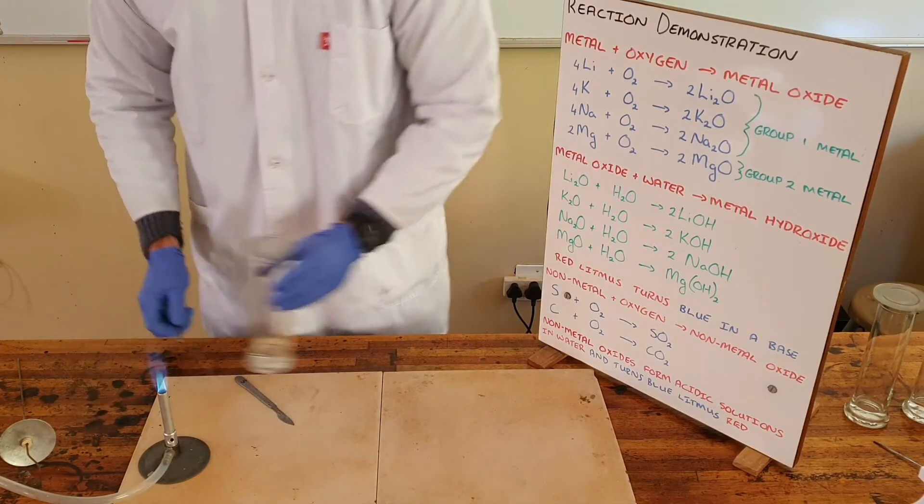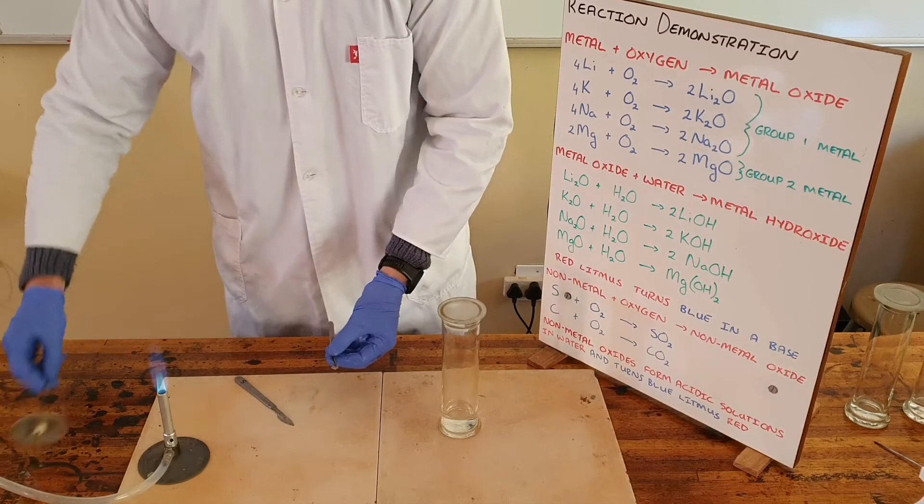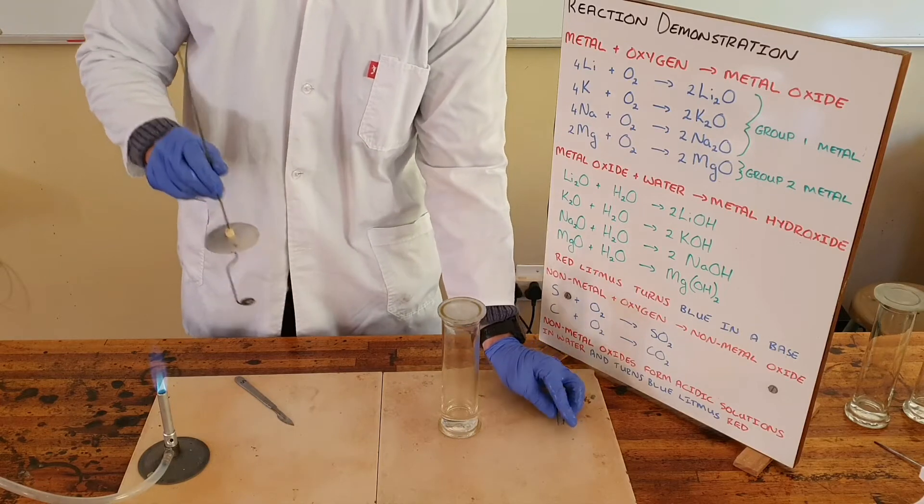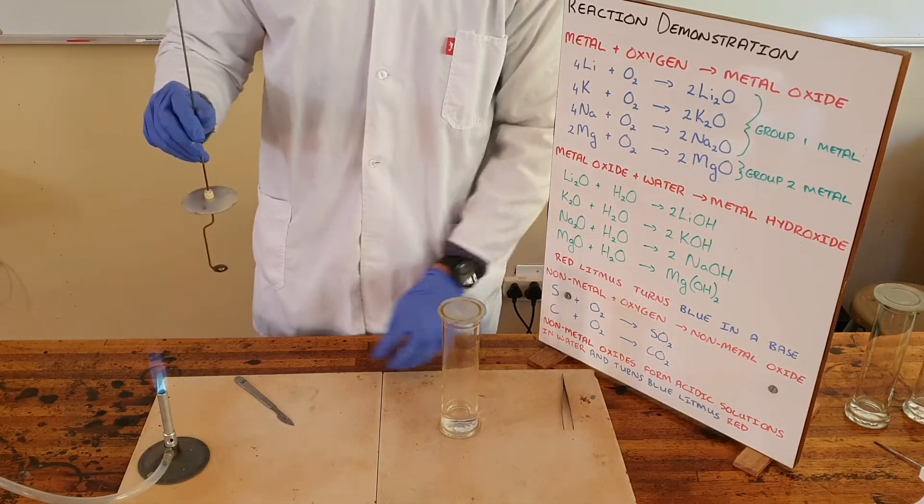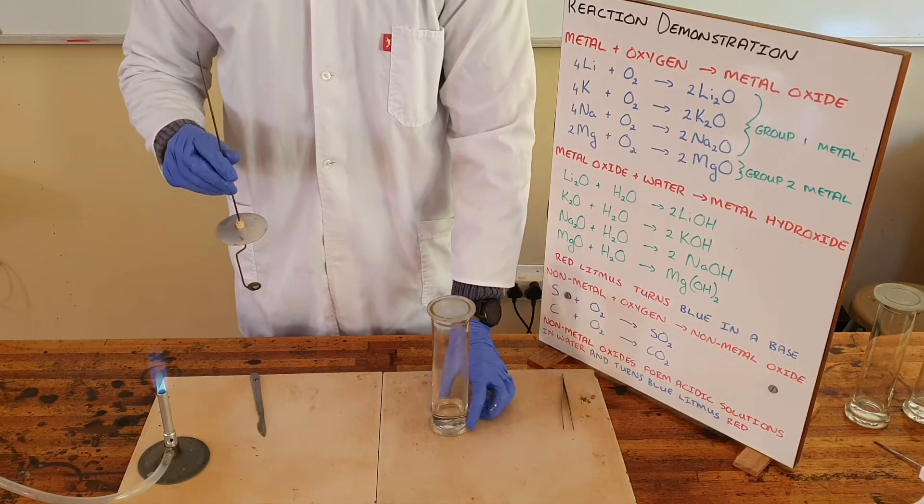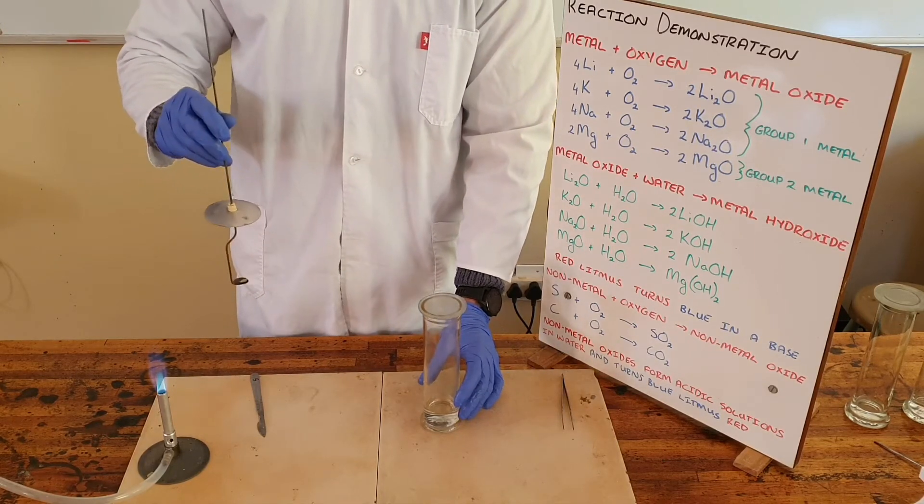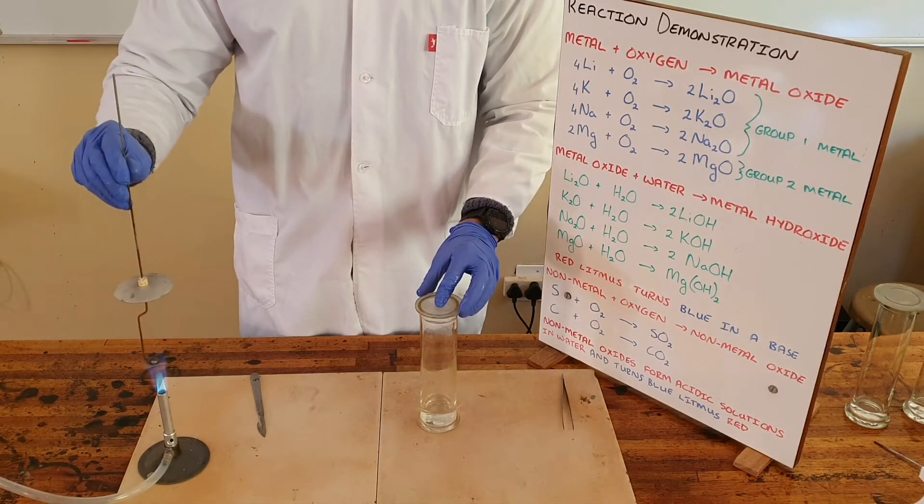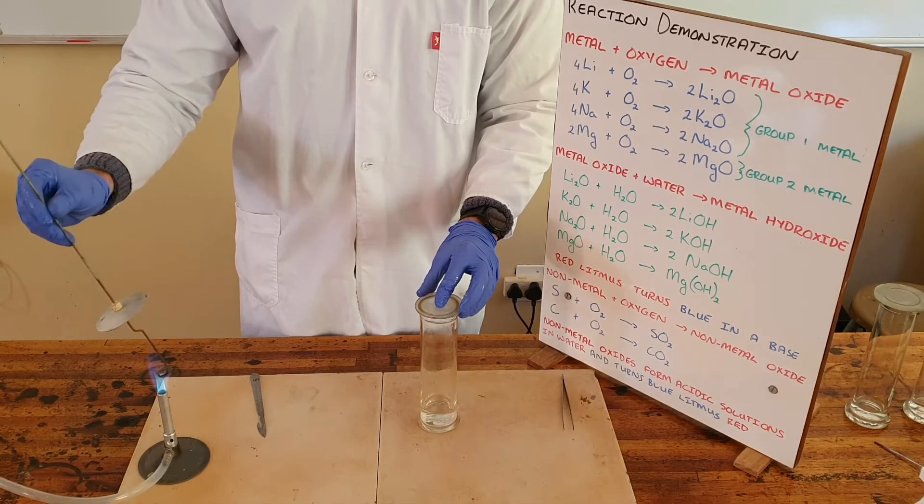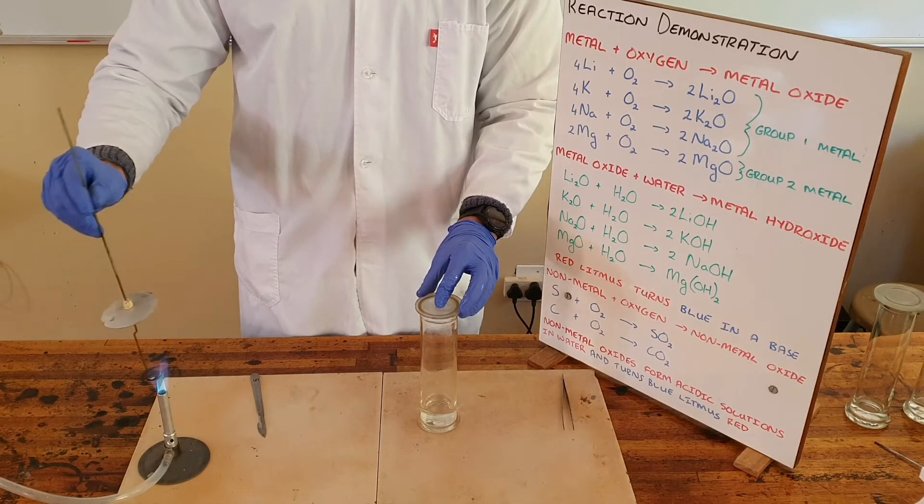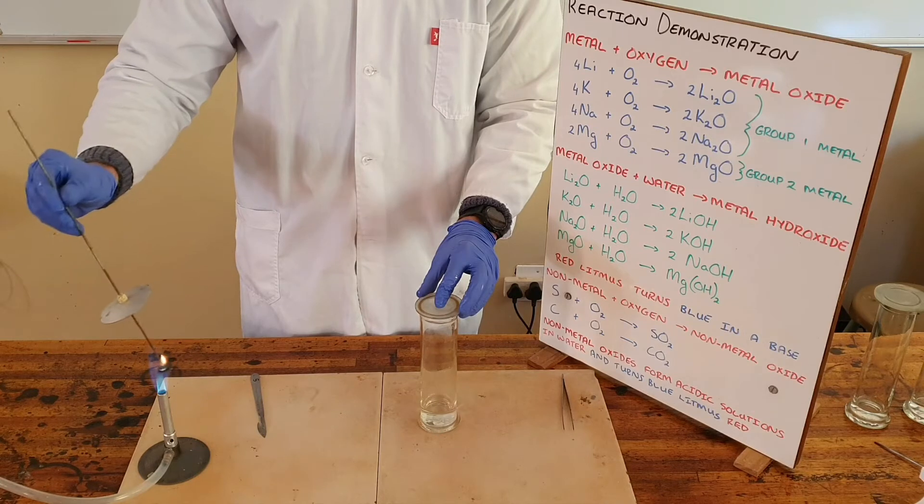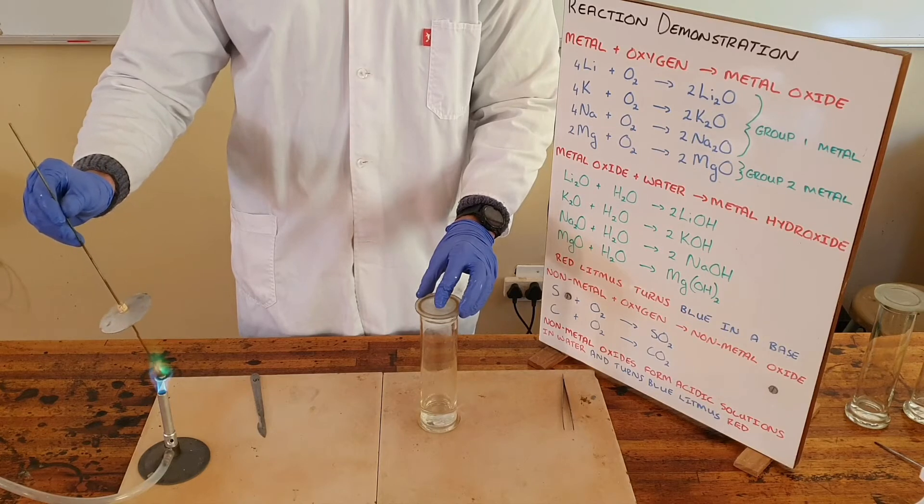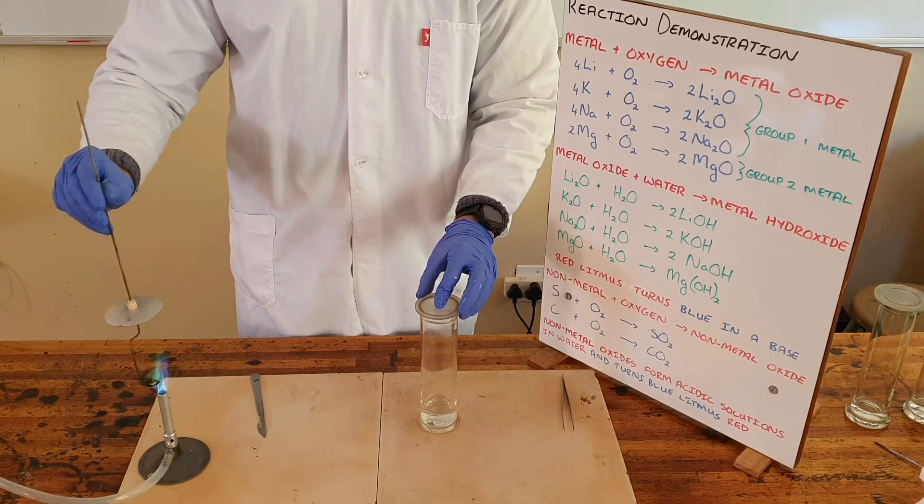What I'm going to do here is I'm going to ignite this piece of lithium using the Bunsen burner and putting it on this deflagrating spoon. Once it is ignited, I'm going to put it into this gas jar that contains oxygen gas, and we're going to see how it burns in pure oxygen. You'll see that the initial reaction here is the paraffin that burns. It burns that yellow flame, and then once the paraffin is burnt off, we wait for the lithium to ignite before putting it into the gas jar.